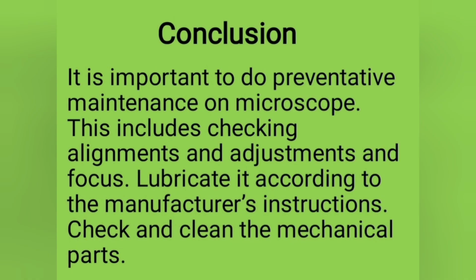So in conclusion, it is very important to do preventive maintenance on microscope. This includes checking alignments, adjustments, and focus. Lubricate it according to the manufacturer's instructions. Clean and check the mechanical parts.